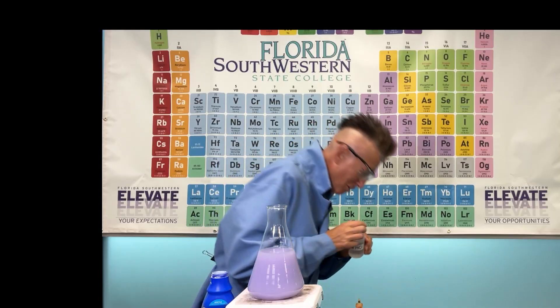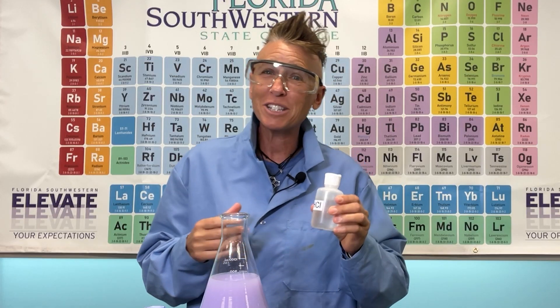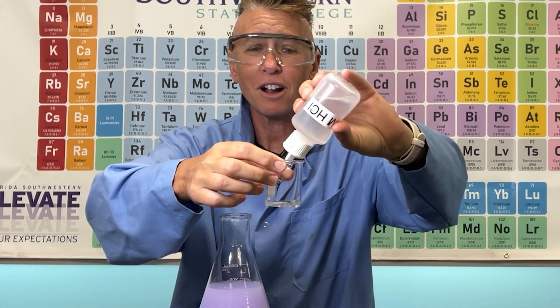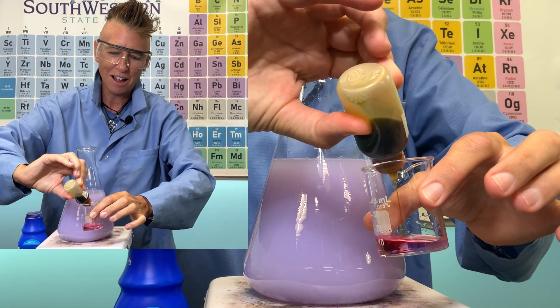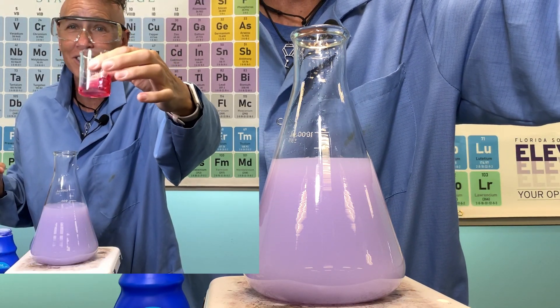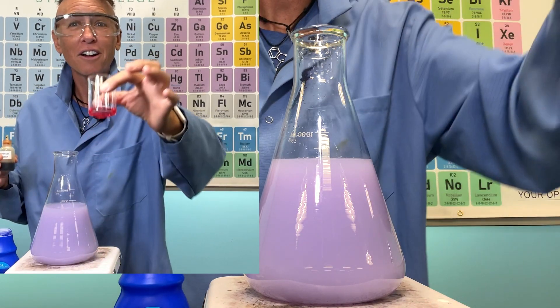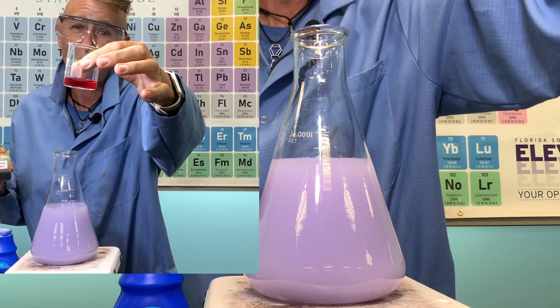Next for this experiment, we need stomach acid. I have my stomach acid, which is hydrochloric acid. What would be the color of the stomach acid with the acid-base indicator? It is a strong acid that dissociates in water, releasing hydrogen ions. It's highly reactive with bases and can neutralize them. Because of the hydrochloric acid, it has turned our acid-base indicator to this nice, beautiful reddish color.